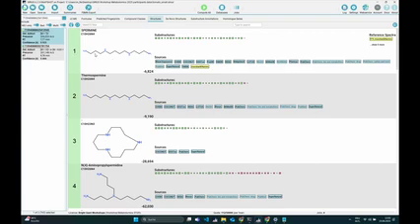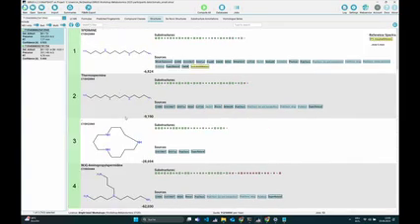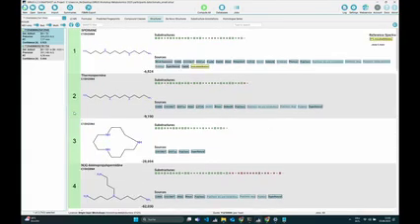Why are they highlighted? They're highlighted if the structures are really similar. We use an MCS distance of up to 2 to highlight them. And what you can see here, the structures are really quite similar. What is a little bit weird is that you also have this ring structure, but except for this ring, everything looks quite similar. But this is just something that you have to keep in mind. And maybe I can show this now.